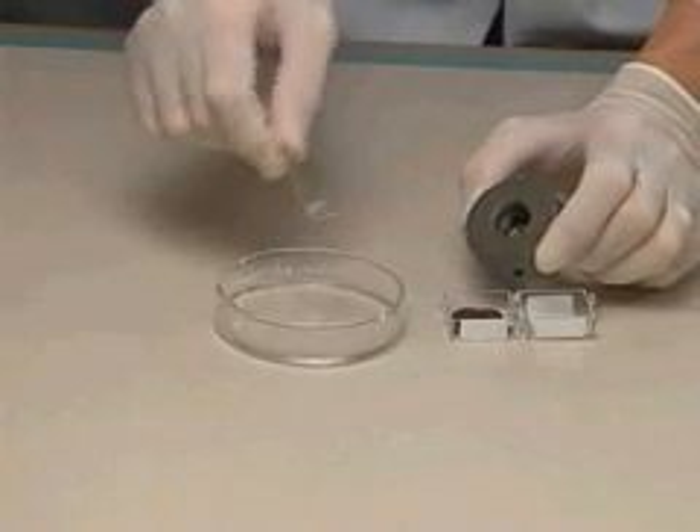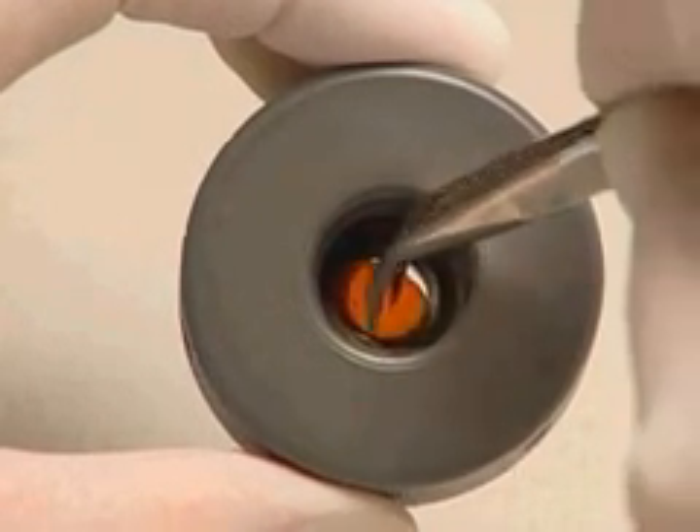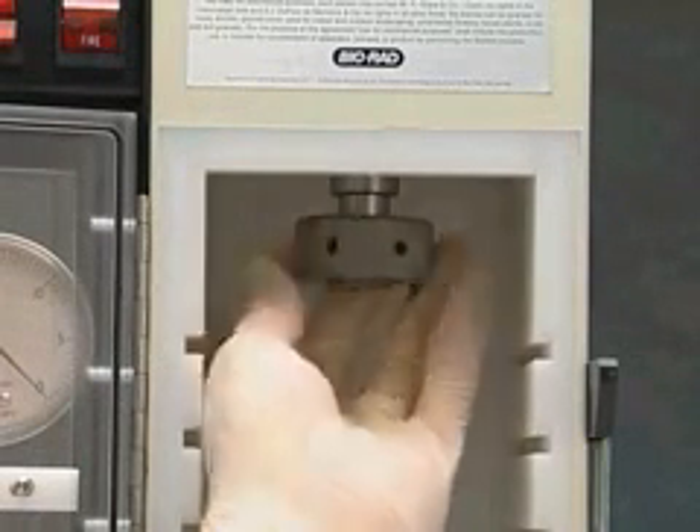Briefly wet the rupture disc in isopropanol and place it in the recess of the sterile rupture disc retaining cap. Screw the retaining cap onto the end of the gas acceleration tube.